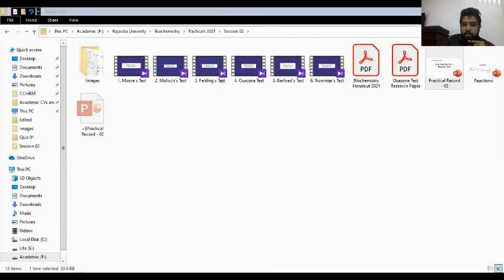Usually, this osazone formation is pH dependent, and as I said, osazone formation happens at 100 degrees Celsius at 4.3 pH. Sorry, not the melting point of water. Okay, so we can maintain the 100 degrees Celsius.